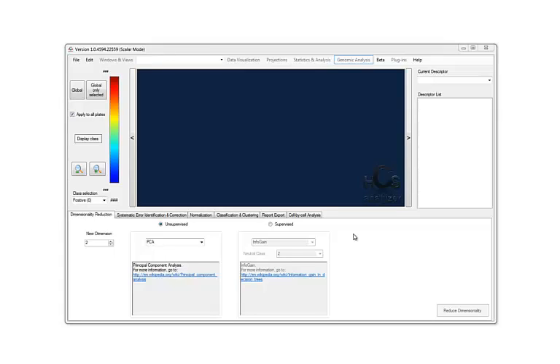So welcome to the HCS Analyzer tutorial. Today we'll talk about cell-by-cell data analysis. This tutorial will be divided into different chapters, and the first one will be talking about how to import and generate a database that can be used afterwards for data analysis.